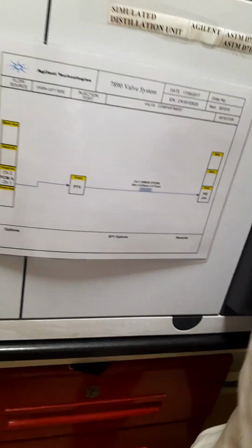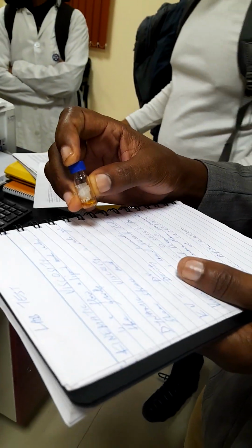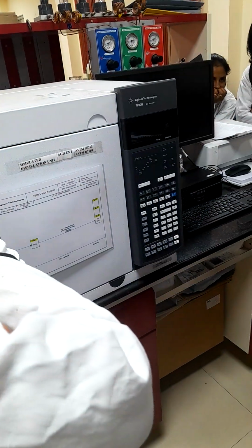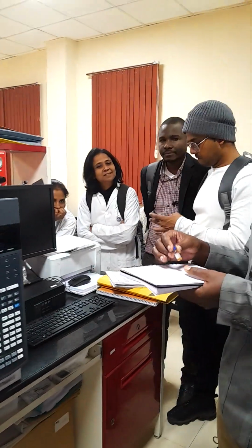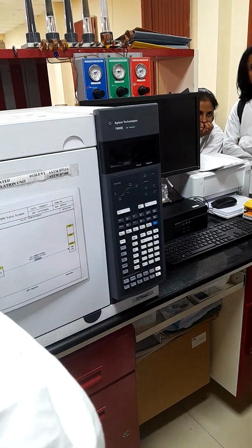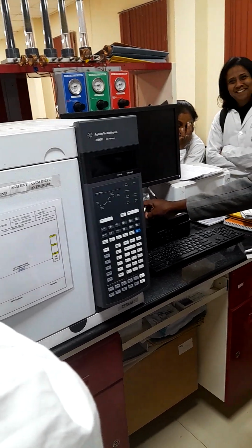Okay. I have a question. Please ask. Assume now you have been given a sample and the sample comes to the laboratory. Before you do this GC technique, what preparation do you have to do with your sample? I will tell you all the points. You will get them early on.